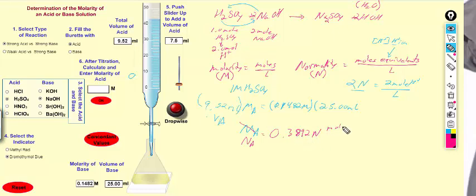Again, that's moles of hydrogen ion, not hydrogen element, per liter. Remember to go to 4 decimal places, right? Well, actually, it would be 3 decimal places because the volume here of the acid is just 3 decimal places. So 0.389 would be fine. But this number is actually twice the concentration in molarity.